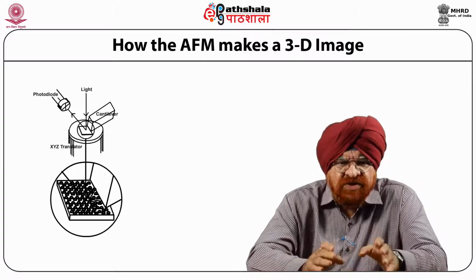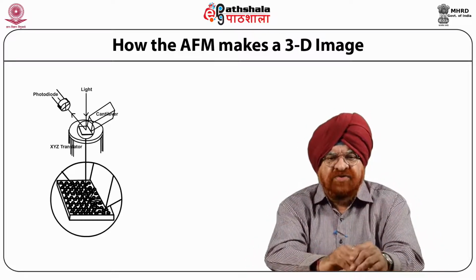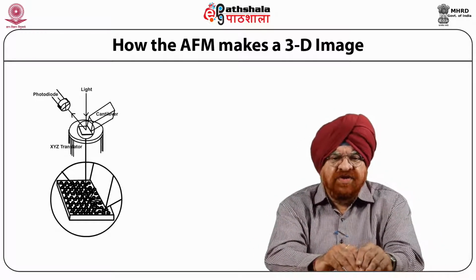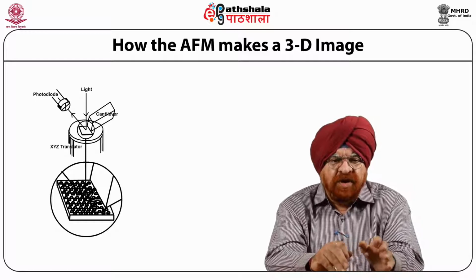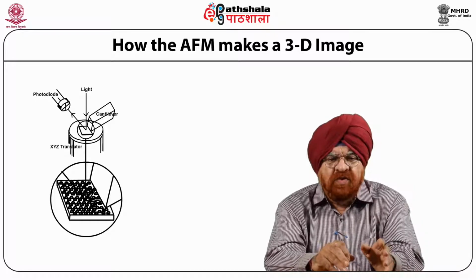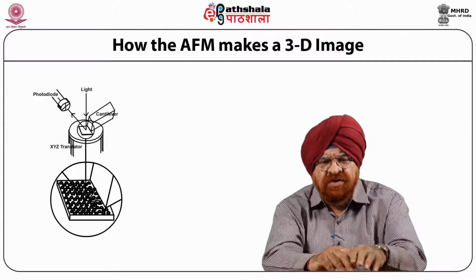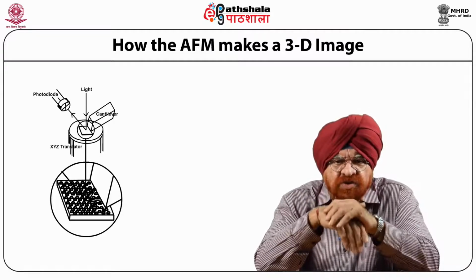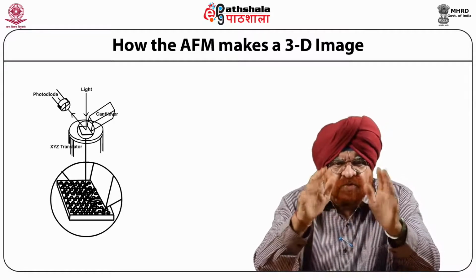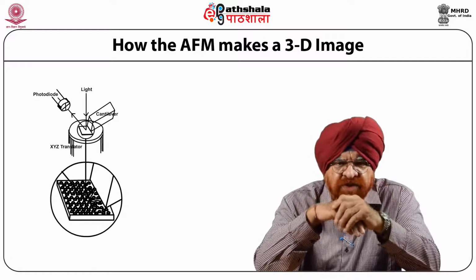The deflection of the stylus is registered by the laser and photodiode sensor, and the XYZ translator adjusts the stylus or specimen, depending on the microscope, up or down in Z to restore the stylus to its original orientation. The computer stores the vertical position at each point and assembles the image.